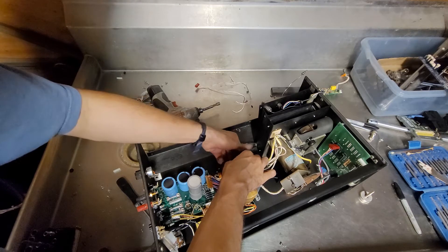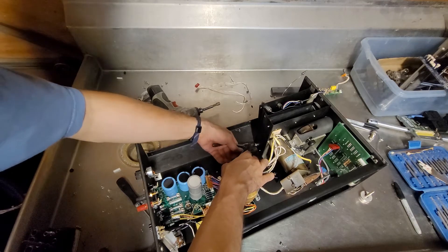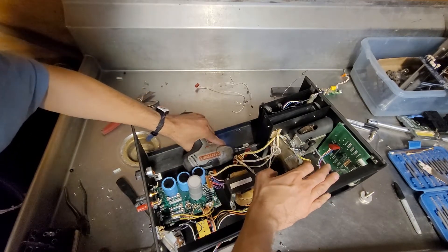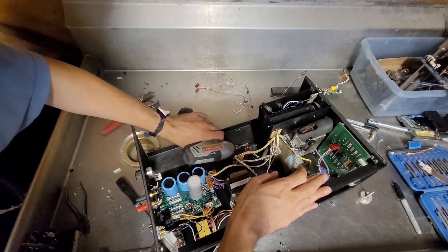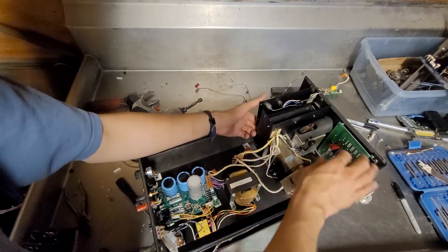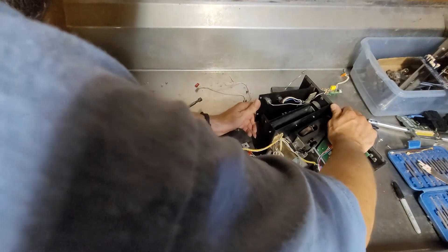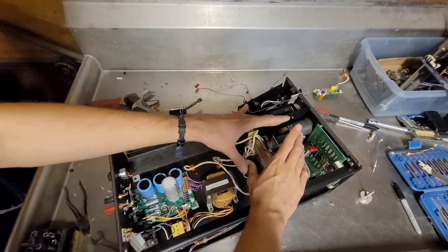Now I'm just starting to get annoyed. Definitely not fun to tear this one down. This is like the most difficult part of the teardown. I don't want to destroy this.